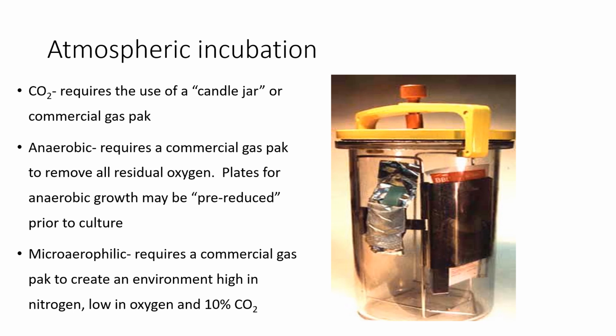So we've got a CO2 atmosphere, and you can see that jar over there on the right. In a CO2 atmosphere, this is also known as a candle jar, we can use a commercial gas pack. We put that gas pack in the jar, and then we shut the lid, and what it does is it extinguishes all the oxygen and provides carbon dioxide. Back in the old days, you would put a candle in the jar and light it, and then when the candle went out, it produced CO2.